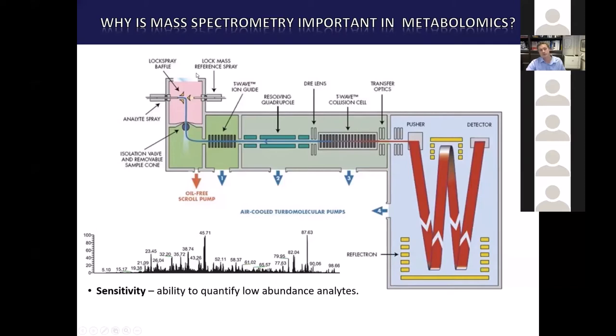So cells, for example, other biologists will correct me, but I think we're talking at least five, maybe six orders of magnitude in terms of the abundances of different metabolites, from glucose in the millimolar range down to things very much down in the femtomolar and probably lower as well, but that gets challenging to detect. But sensitivity is very important, so we can get down to those low levels in order to access comprehensively what the small molecule profiles from cells and tissues look like.